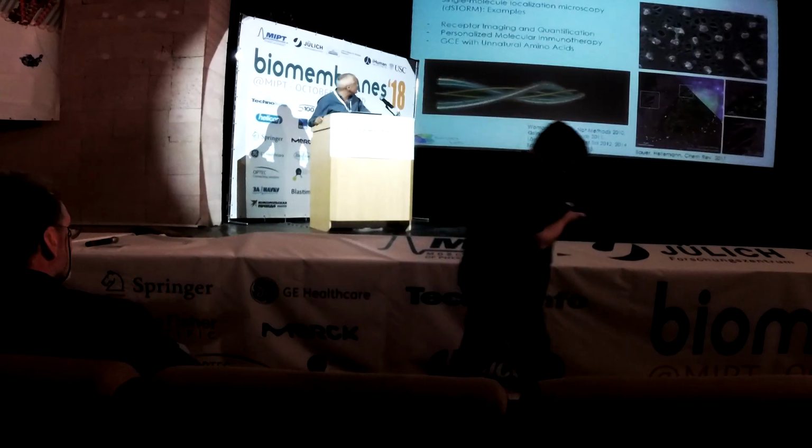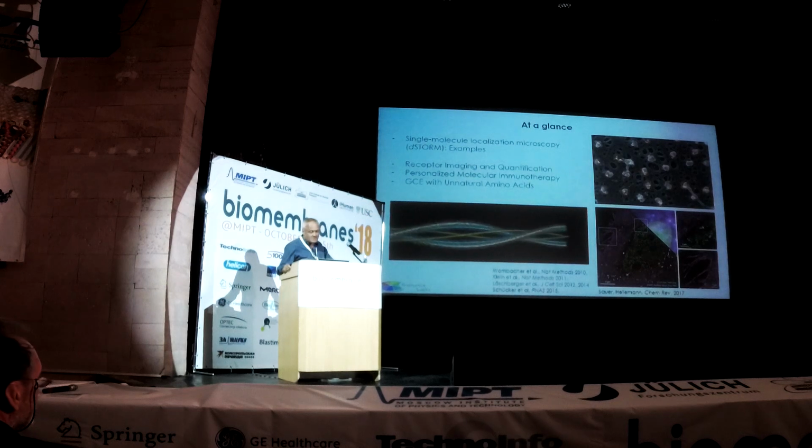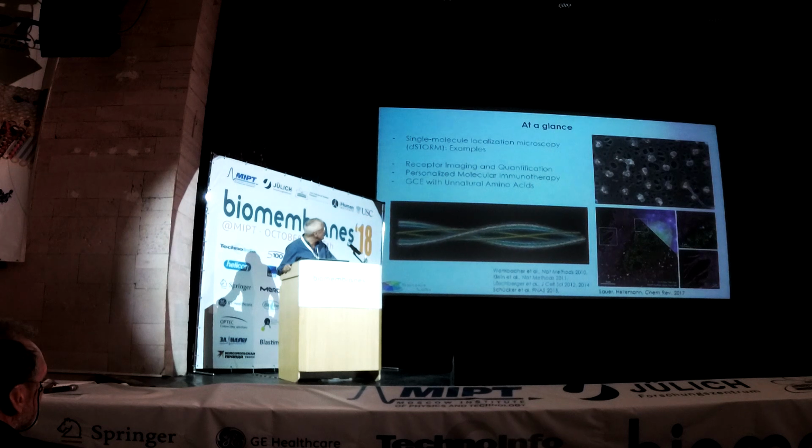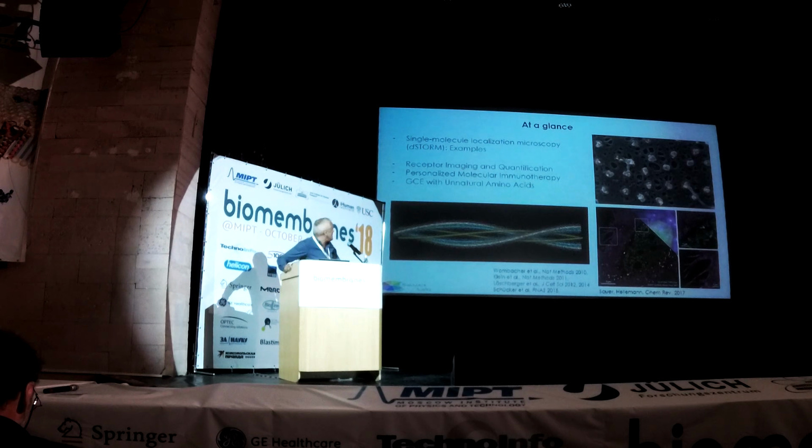and with the title Where Next, which means that I will just give briefly an introduction into the field of super-resolution microscopy, with special focus on single molecule localization microscopy, a few examples really just briefly, and then we'll introduce to you a few fields we started to investigate 2-3 years ago, which is receptor imaging and quantification, and the use of this technique in personalized immunotherapies, as well as genetic code expansion, in other words, to use unnatural amino acids for labeling of proteins of interest.